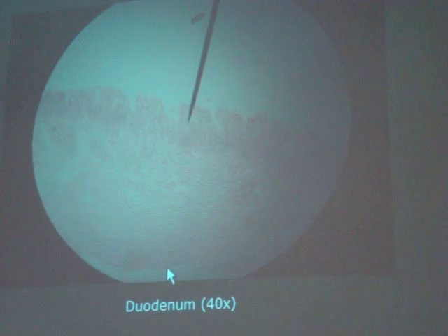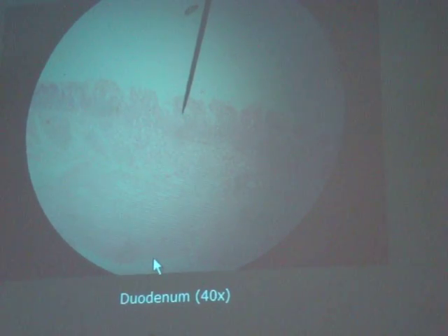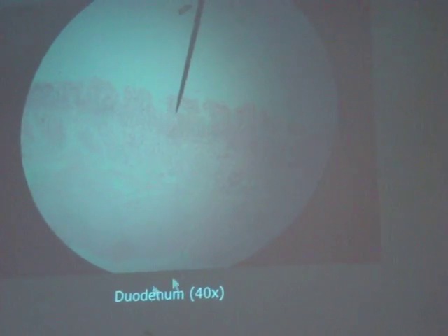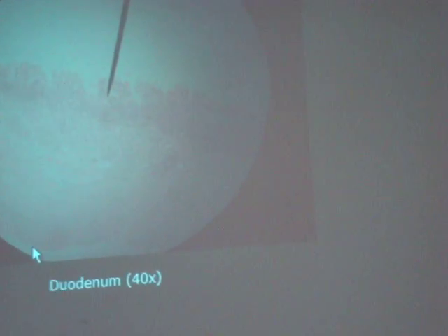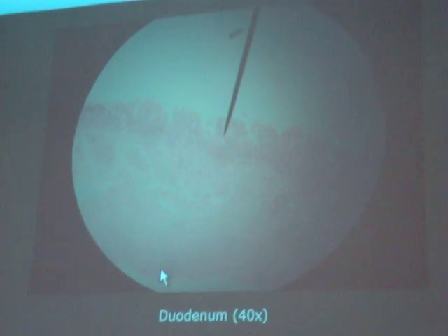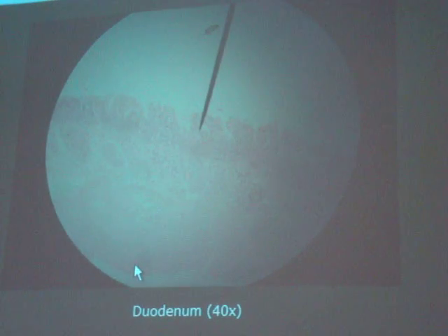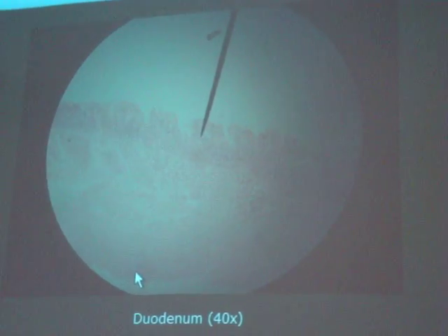If I were to point at this outer layer, you can think back to the artery. If I pointed at the tunica intima, it's that single layer on the inside, whereas this is just going to be that single layer on the outside. So it's not the whole white part, it's just the one line, basically. Yeah, it's the lining. The serosa is the lining. Okay. So if I were to put the pointer right there, what do y'all think that would be? The one before the serosa? Yeah, the outer muscular.